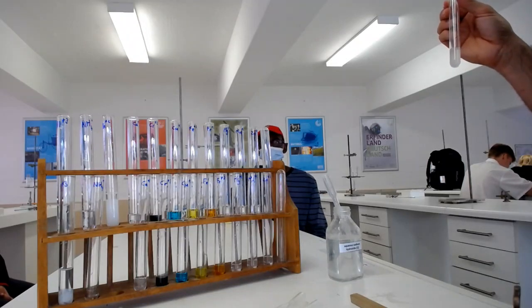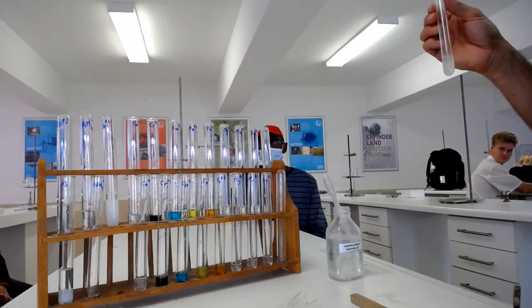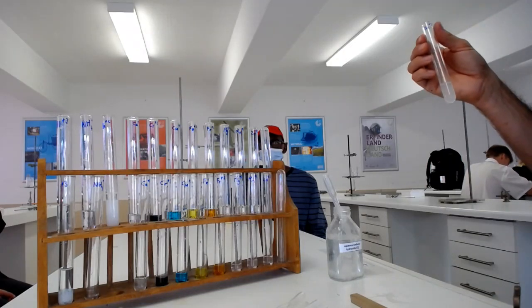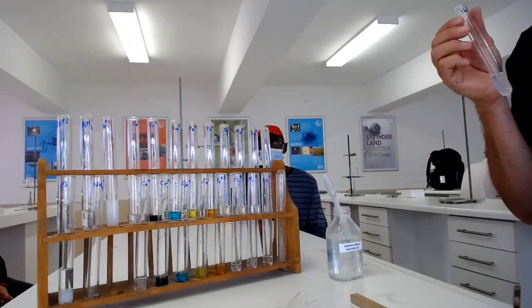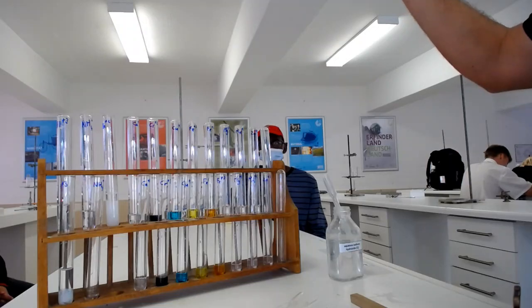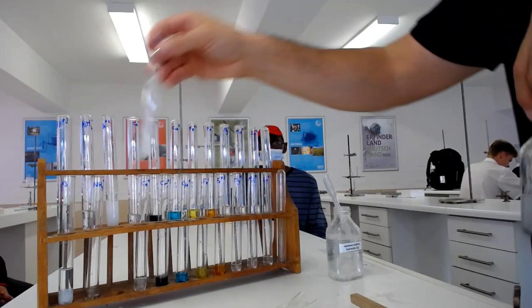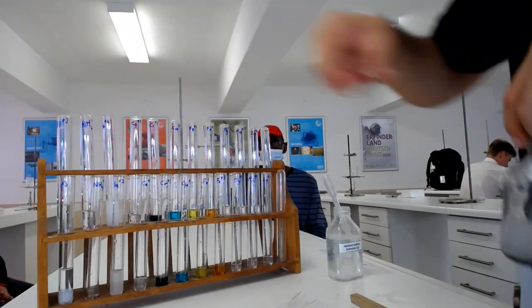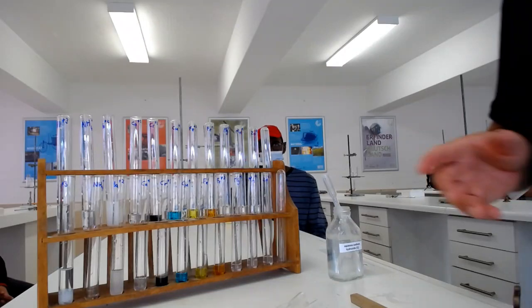There's something horrible in there. Okay, so maybe I've done it really wrong. Right, so we need to retest this. There might be a contaminant in there, so we need to redo the barium one. That's okay. We can do that.